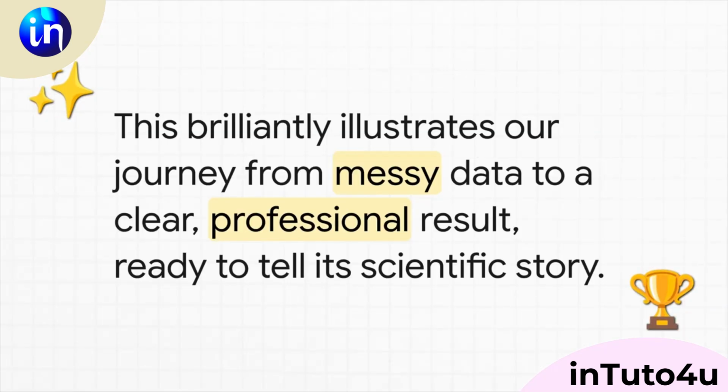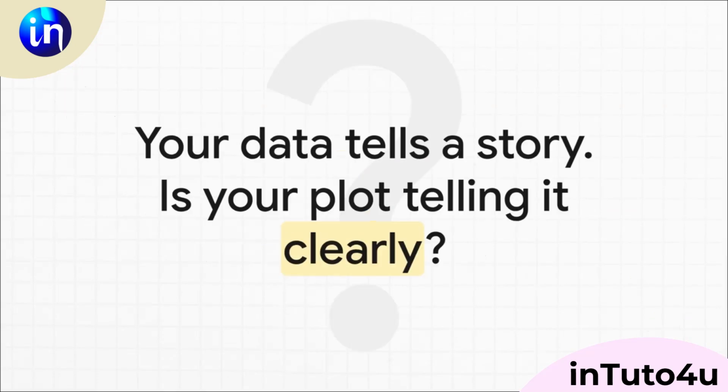And there you have it. Would you just look at that journey? We started with that mess of raw numbers, and now we have this, a clear, analyzed, and totally professional figure that's ready to tell its scientific story. So I'll just leave you with this final thought. Your data always has a story to tell about your material. The real question is, is your plot telling that story clearly?